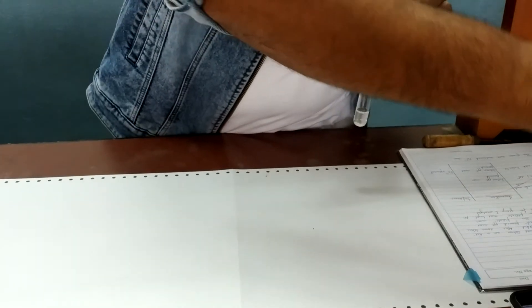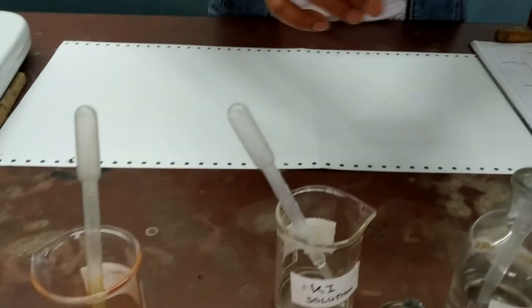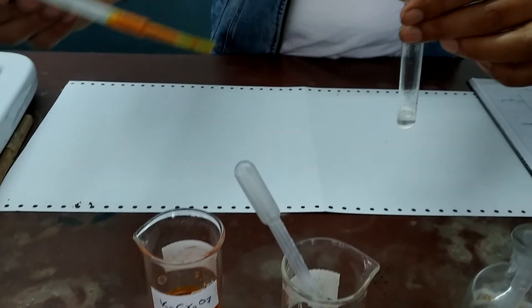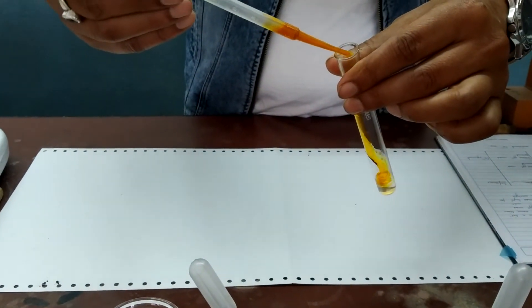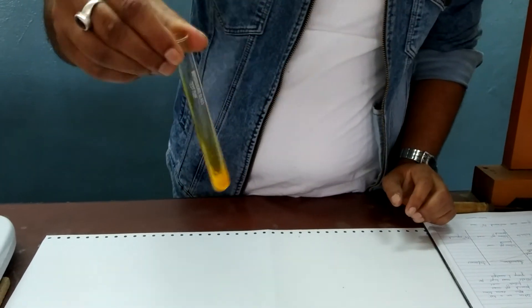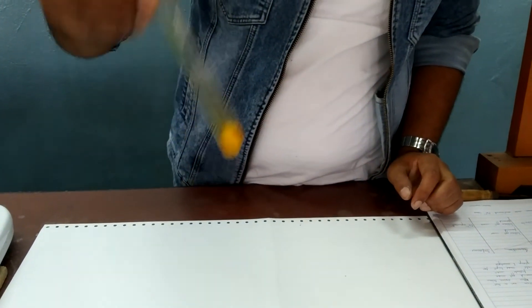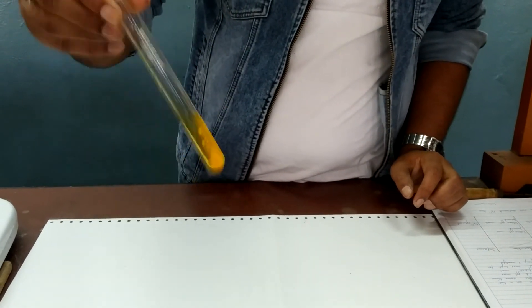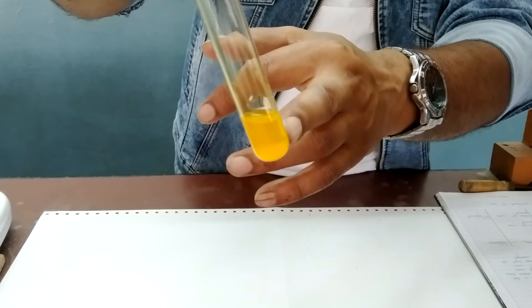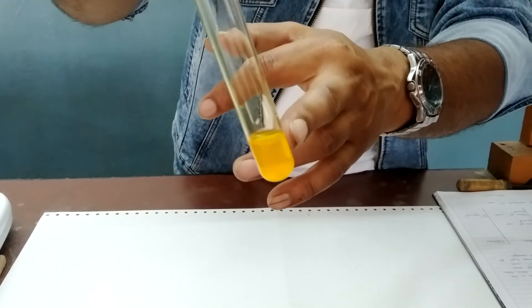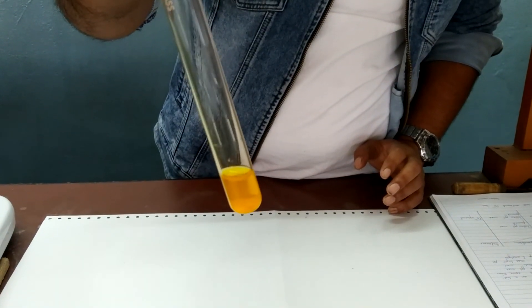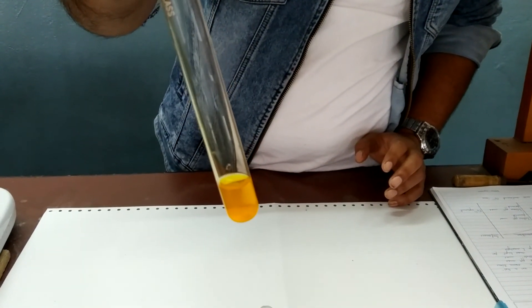And in the other test tube we add potassium iodide solution. As you can see again the same type of yellow coloration. So this yellow coloration confirms the presence of lead in the given sample.